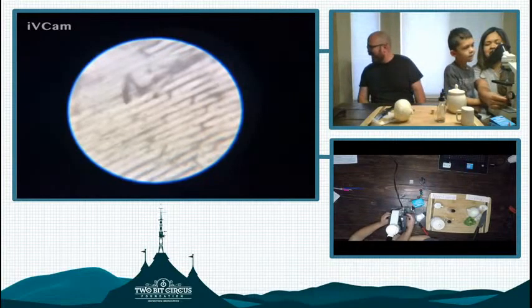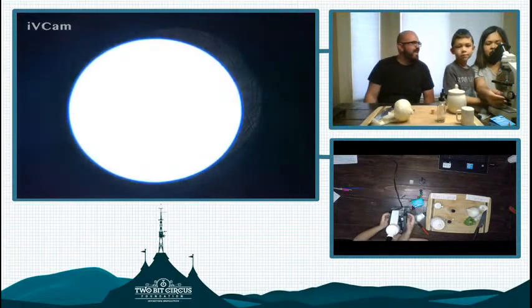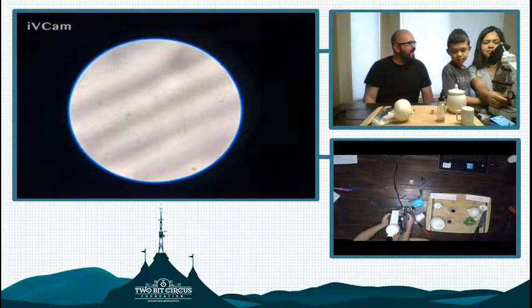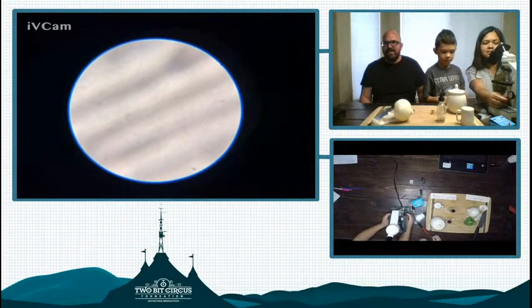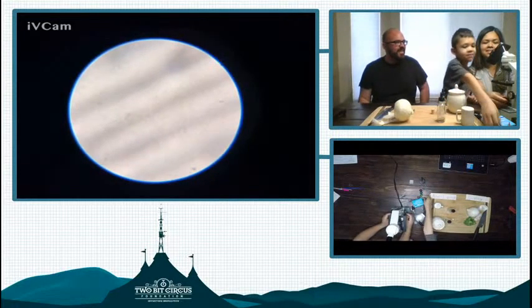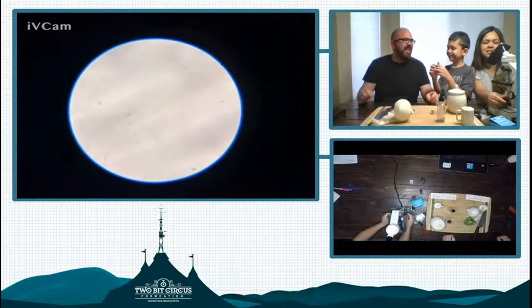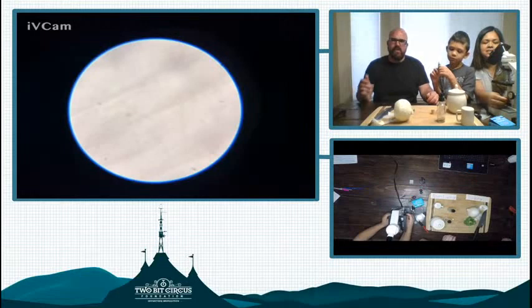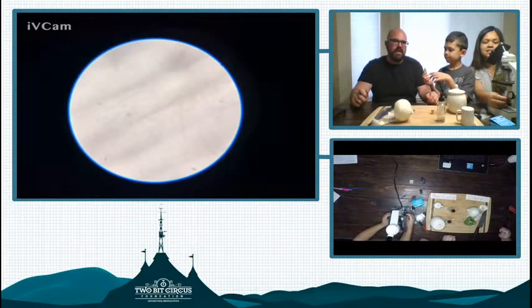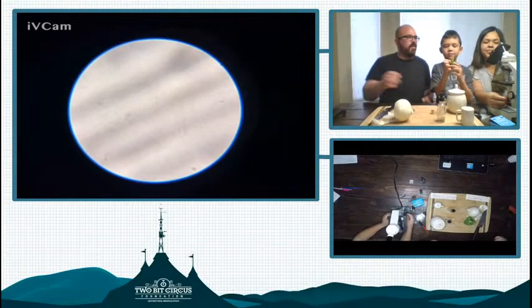Some of us more so than others. Malin over here is a professional biologist. She knows how to use a microscope very well. Me with my engineering background, I just like to pretend I know. No, but they are definitely really fun to use. And they're simple to use for everybody. Once you just learn, the focusing is really the main issue. And then trying to get that through there.